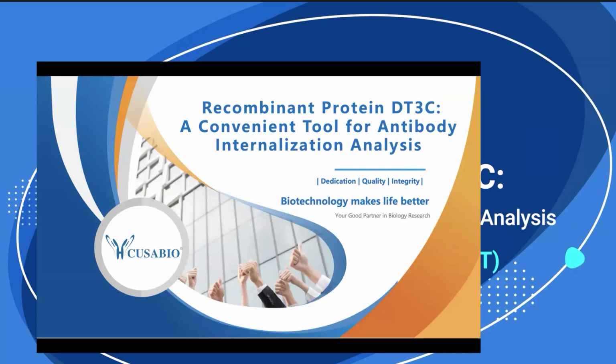Today we are going to talk about the recombinant protein DT3C, and introduce it as a convenient tool for antibody internalization analysis. For today's talk, I will briefly introduce the development of ADC and some current ADC products, and also emphasize the analysis tools related to antibody internalization. And lastly, I will introduce our protein, the recombinant DT3C, and how it's applied in ADC drug discovery.